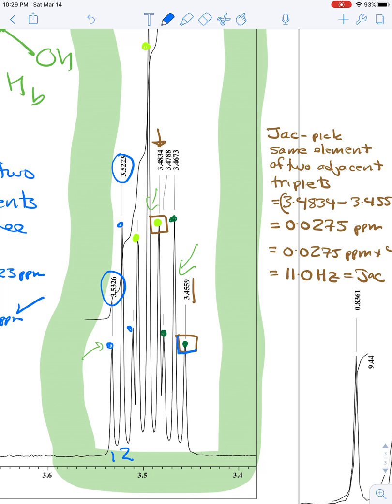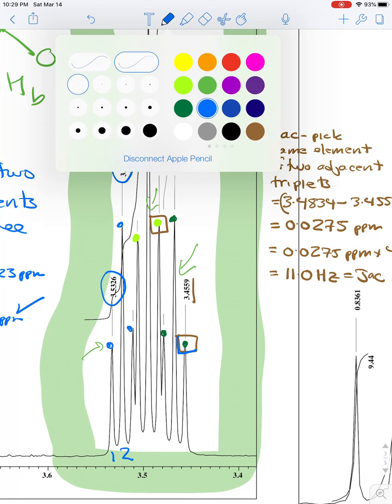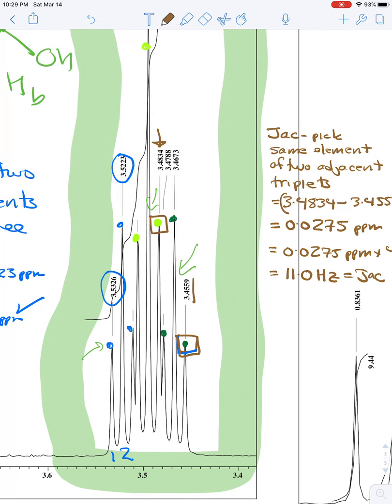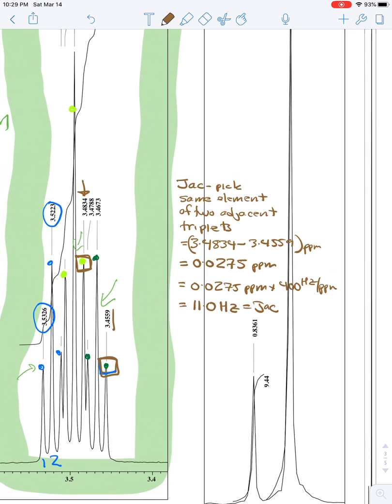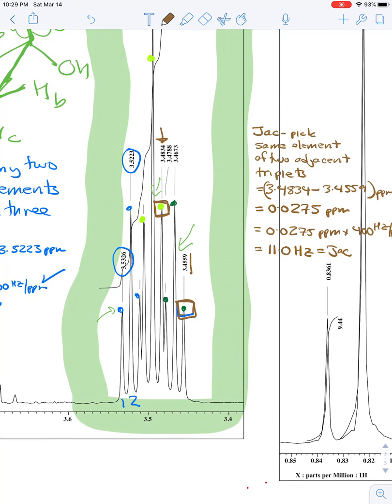And those are the ones that I have boxed in brown. And so again, I'm going to take those two values. Those, by the way, are signals 9, 8, 7, 6. So it's elements 9 and 6 of the triplet of triplets, if anyone is counting.